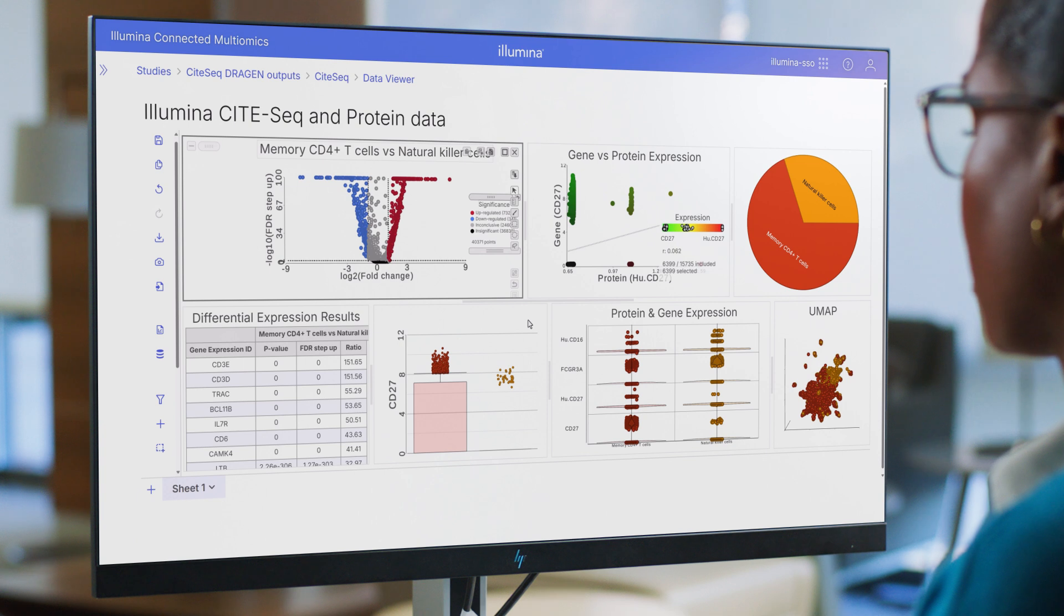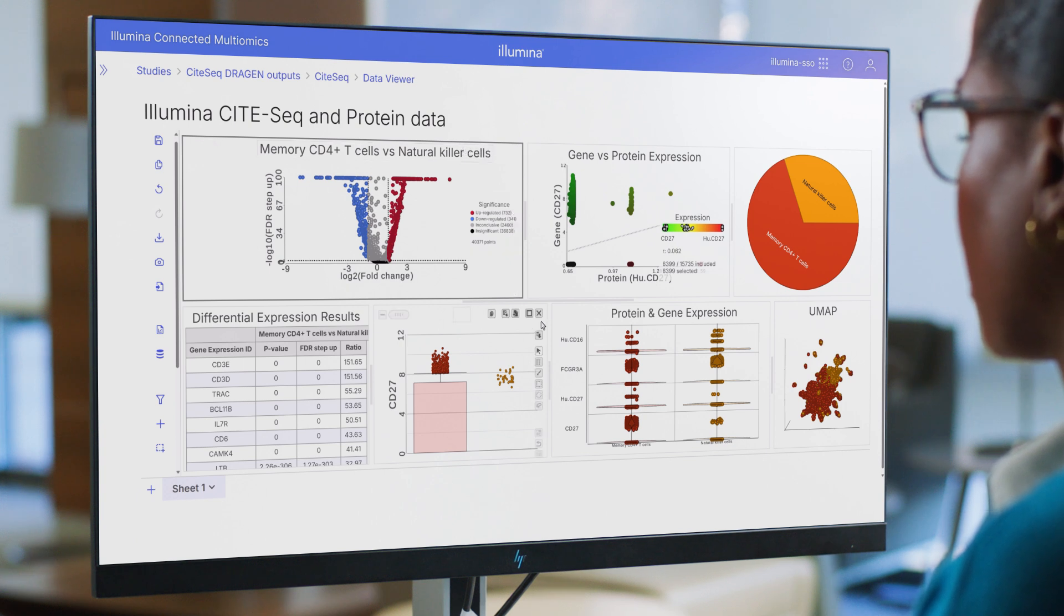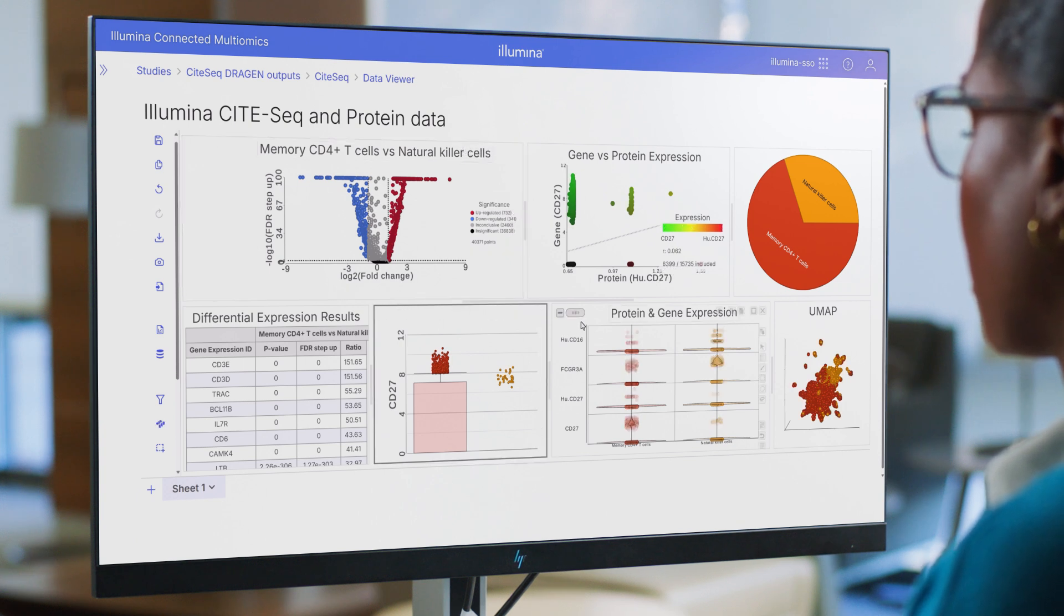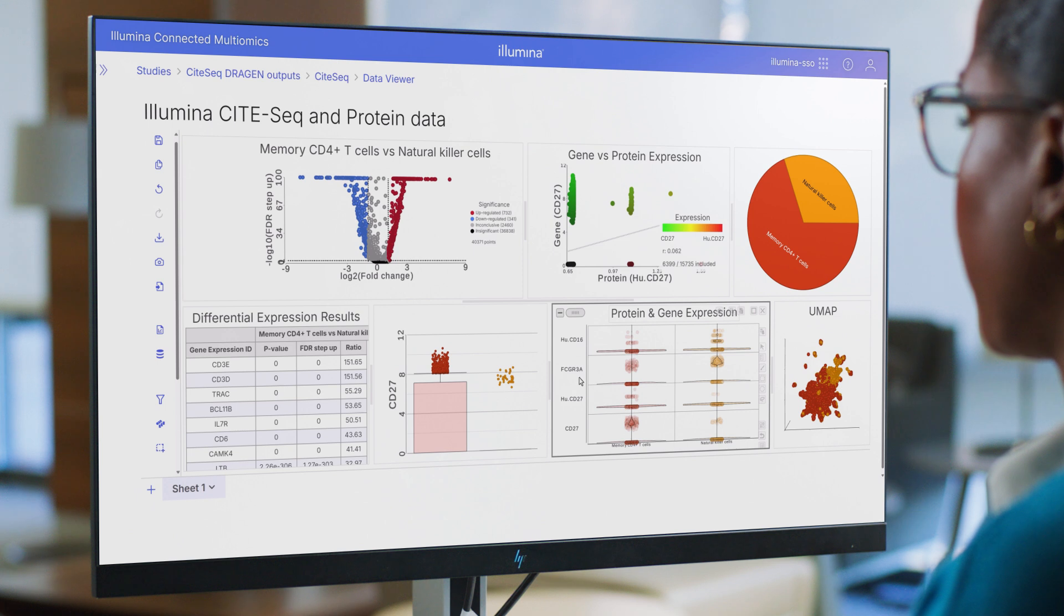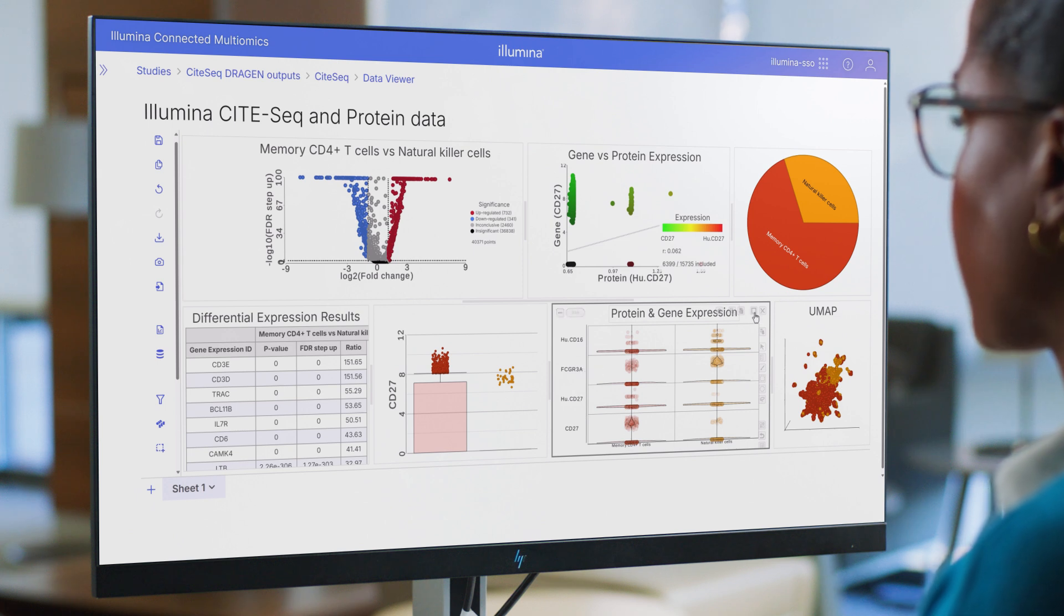Omics data from different applications and techniques sit side by side, providing me a more holistic view of my data than I could ever achieve with a single technique.